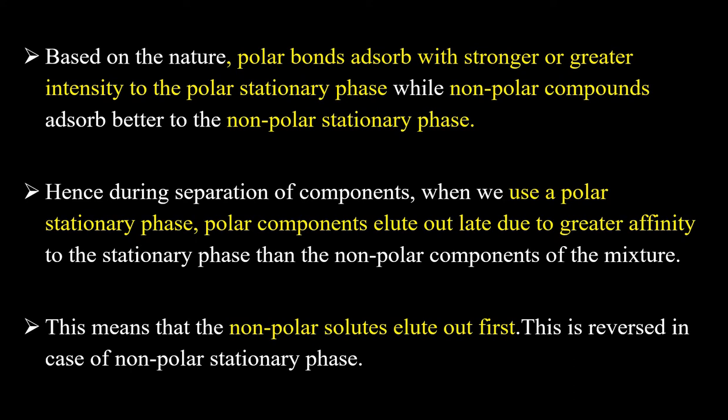Hence, during separation of the compounds, when we use a polar stationary phase, polar components elute out late due to the greater affinity to the stationary phase than non-polar components of the mixture.